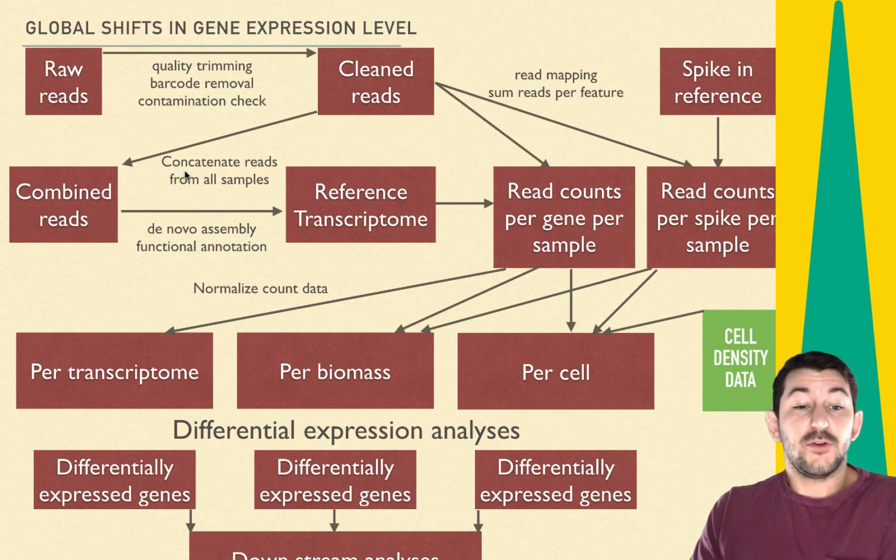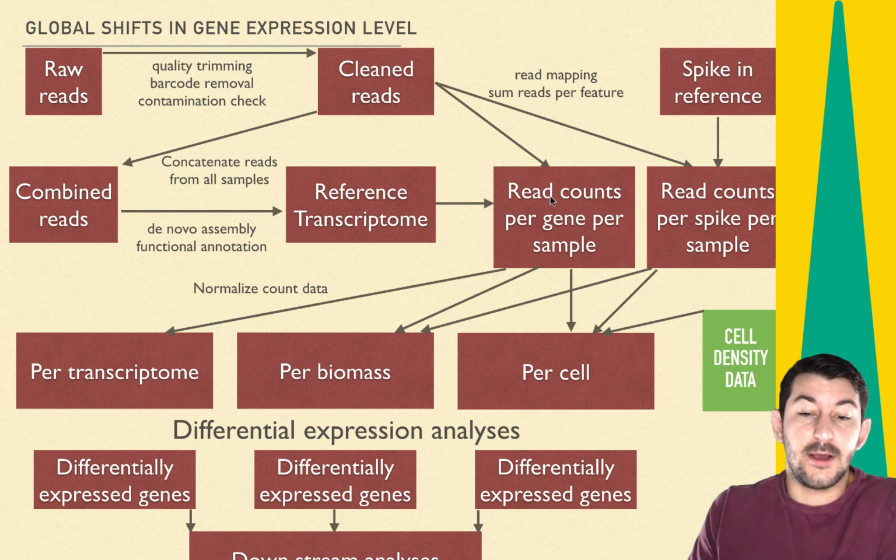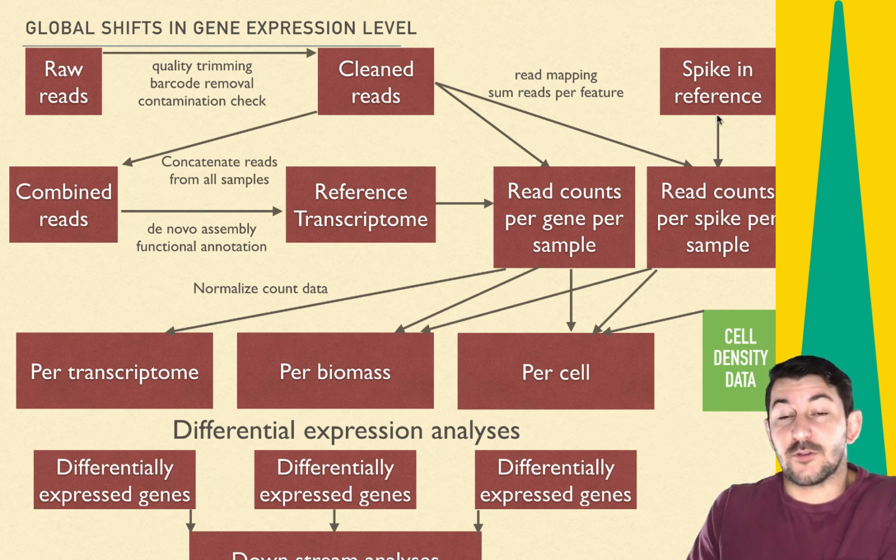you know how to do a lot of these things. You guys know how to take raw reads and do quality control and trimming and taking off adapters. You know how to take your cleaned reads and map them. I didn't show you how to actually pull out the read counts from the mapped reads, but that's relatively straightforward. You can take a reference from your spike-ins and map to those as well.